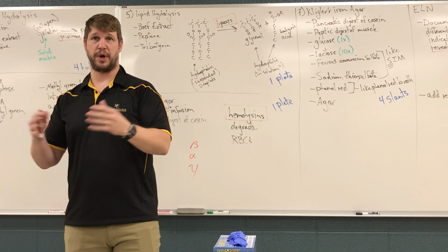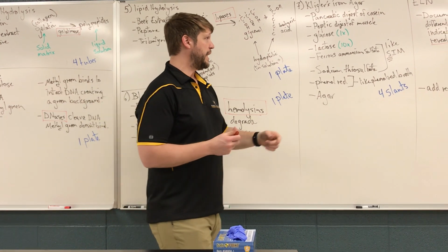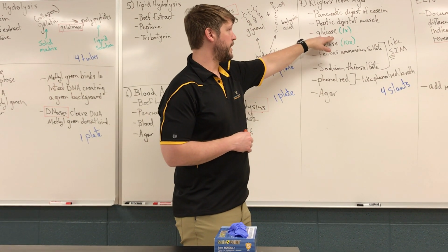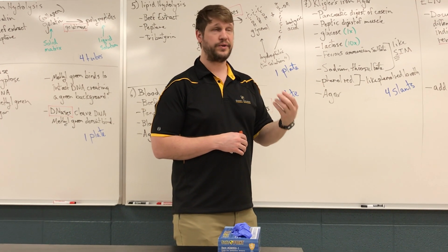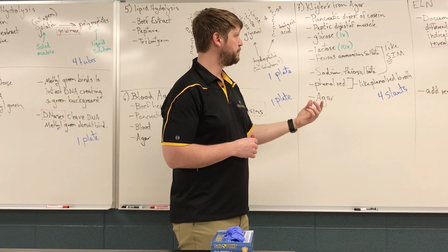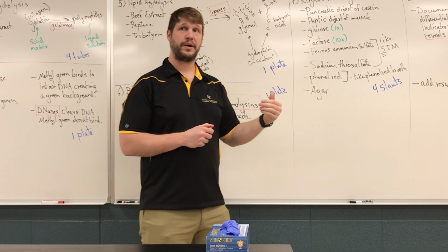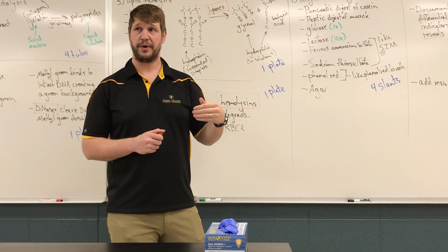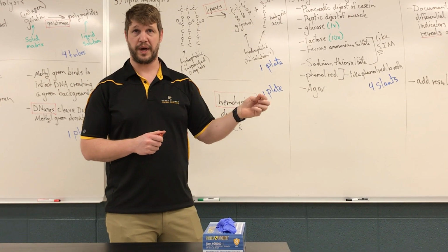It's usable by a much broader spectrum of organisms than lactose is. So initially, most organisms are going to use glucose, and they're going to grow, and you'll be able to determine whether there's been aerobic growth or whether there's been anaerobic growth based on a pH change, just like we did with the phenol red broths.